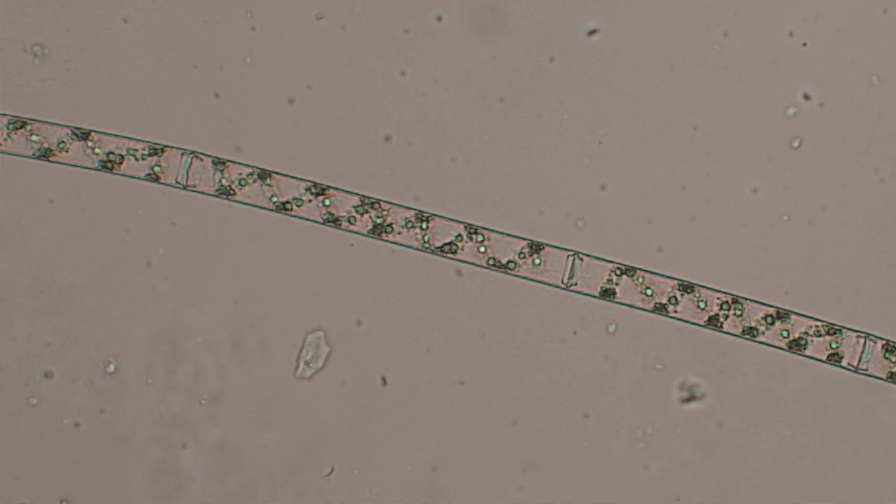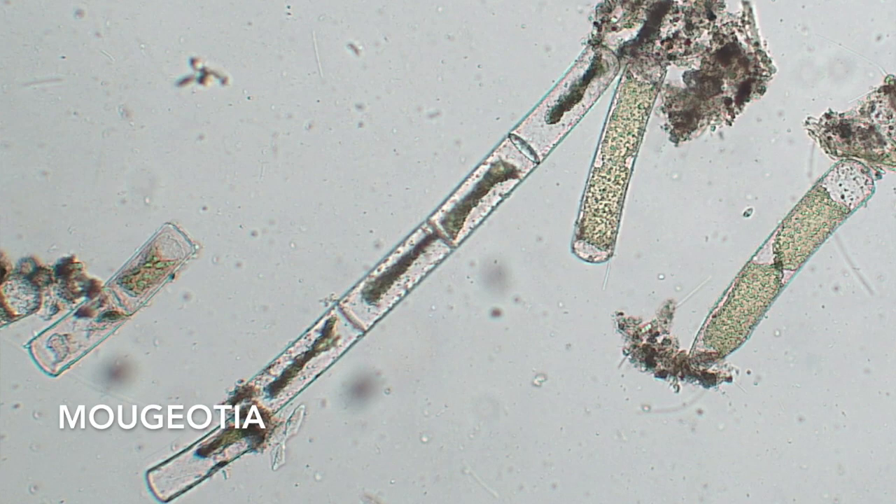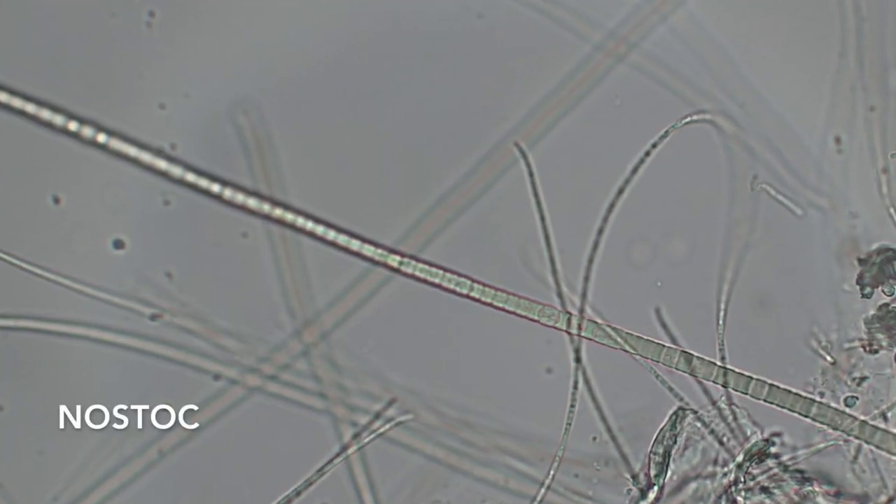If you looked at a leaf under a microscope you'd see green spots — the chloroplasts. You can see that really beautifully here: those green spiral structures are the spiral chloroplasts in this alga, and they give it its name — it's called Spirogyra. So blanket weed, although unsightly at our scale, is actually a really beautiful thing at the small scale. Here's a different filamentous alga called Mougeotia — each cell has just a single flat chloroplast, and it can twist and reorient that chloroplast to optimize the amount of light it gets. Algae can be pretty clever.